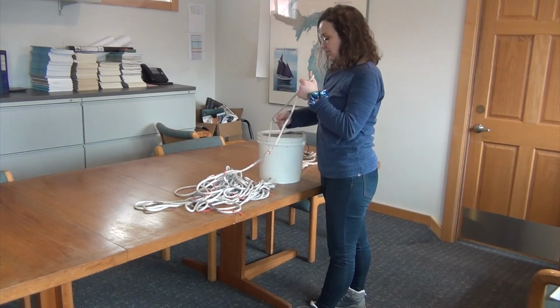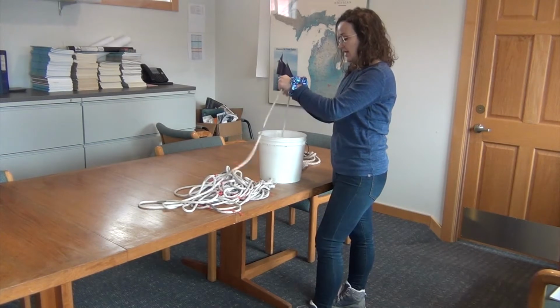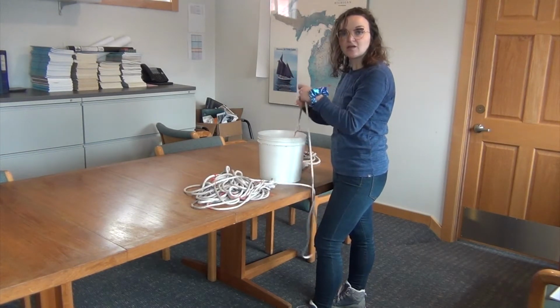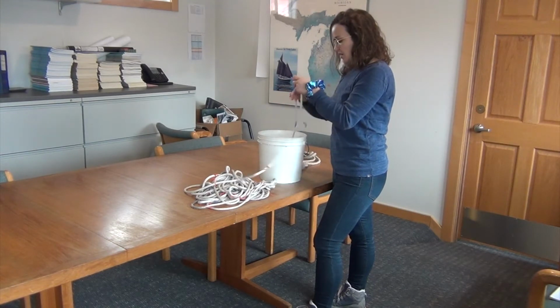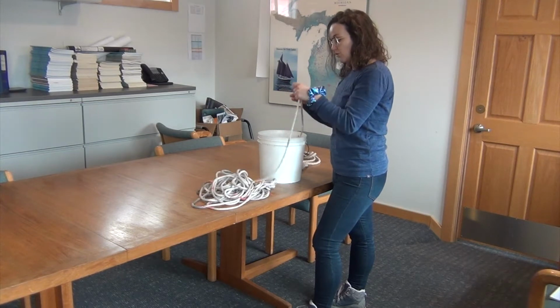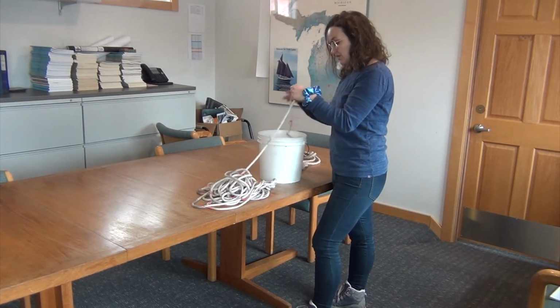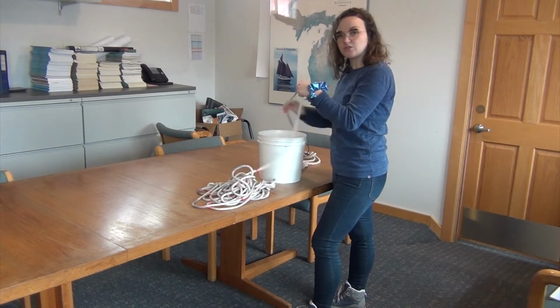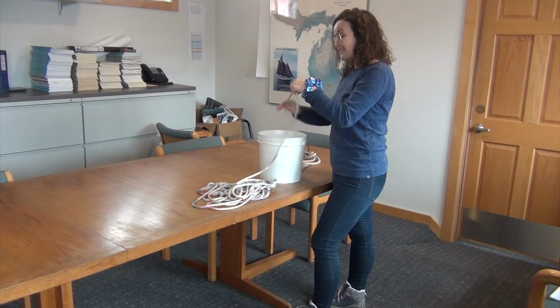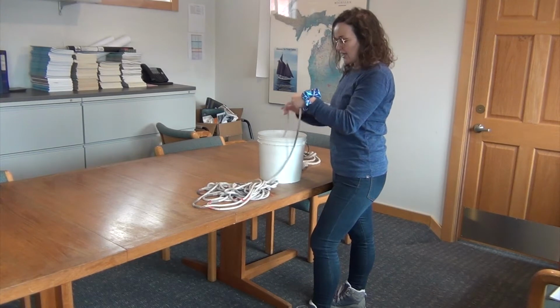Now you're going to put the Secchi in first and then loosely feed this line in. There's no sense in taking the time to coil it around the side. We just kind of are spaghetti tossing this right in here. This is a great job to give to a student who might be feeling a little antsy. They need something to do with their hands. And that way your hands are free to explain some of the graph materials and charts and diagrams so that they can interpret their Secchi disc reading.